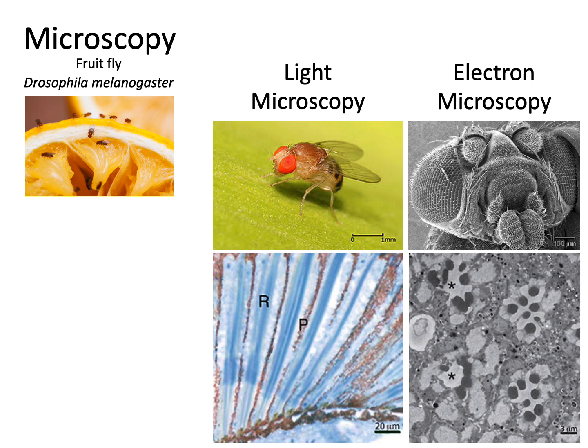left image, but instead a compound microscope, which is the one that you would usually find in a teaching lab where it has a stage that can handle some sort of a slide, right? And the slide usually has some sort of transparent specimen or tissue on it. So the upper left and lower left, those are light microscopy. Now on the right, we have electron microscopy.